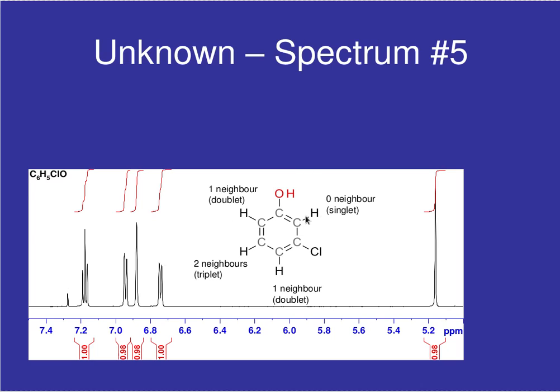See, this proton has no proton neighbors, and so you will see that it appears as a singlet. And then let's move our way around. We have got a proton that has one neighbor and another proton that has one neighbor, and both of those are doublets, which you see over there. However, one proton has a neighbor on either side, and if it's got 2 neighbors, therefore it's going to end up being a triplet. So this compound, we have fully assigned the compound.